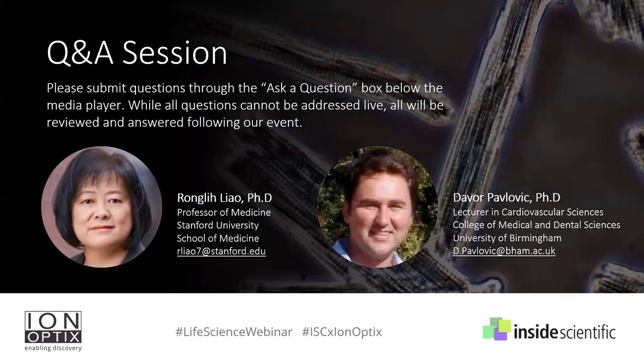Yeah. Perfect. Now, one registrant asked: after isolation, we obtained cardiomyocytes with good survival. However, when they're added to a medium with the smallest amount of calcium, they die. How do you avoid that? Rongli, do you want to lead this one?